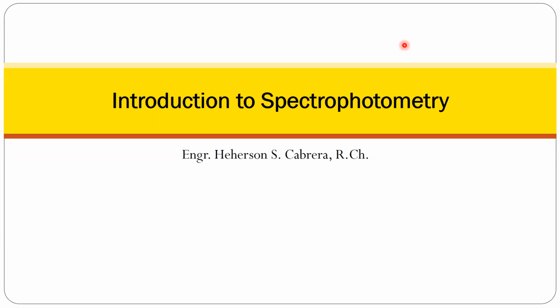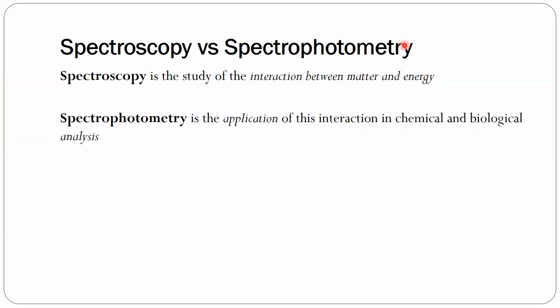Okay, but today, for this course, from weeks 9 to 11, ako yung makakasama ninyo. And the part na na-assign sa akin na ituro ay yung spectrophotometry and its applications. Okay. Let's start by defining what spectrophotometry is.